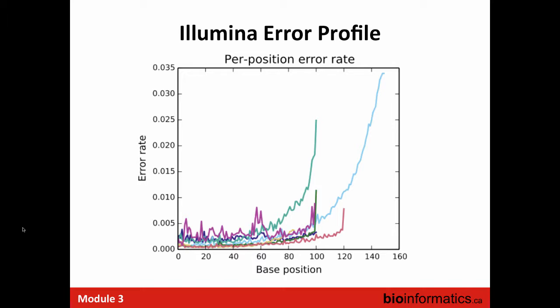So when you sequence a read pair, which is something I'll come to, the first read will be on the forward strand of the reference. The second read will be on the reverse strand. So when you look at it in reference coordinates, it would be the lower coordinate with the higher error rate. But we always think about the errors in terms of the strand that was actually sequenced. So it's always the three prime end of the strand that was sequenced. I can come back to that.